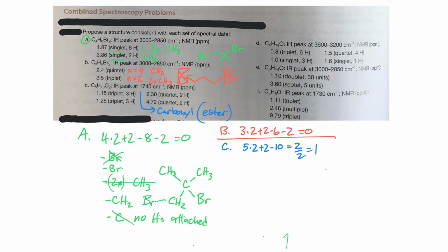So when we have signals like this, a 3-hydrogen triplet down near the 1 ppm range and a 2-hydrogen quartet shifted downfield in the 2 to 4 range, that's typically indicative of an ethyl group. Let me draw that a little better here. Where X is something that does not contain hydrogens, we've got that ethyl group hanging out there.